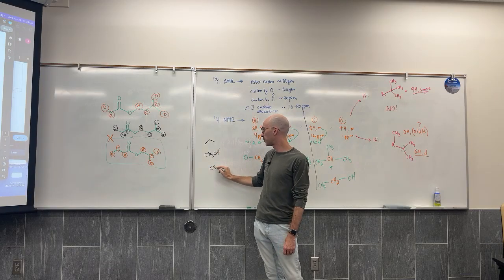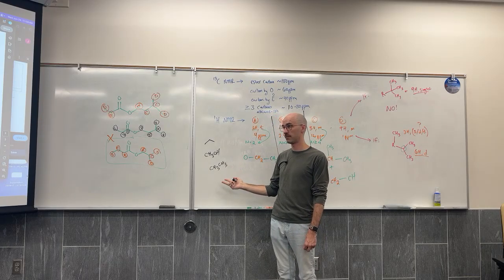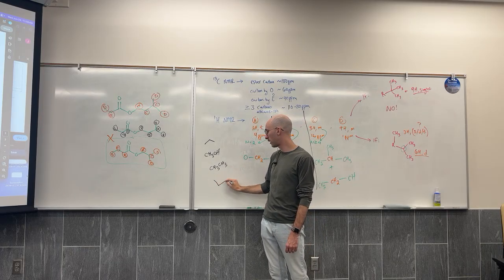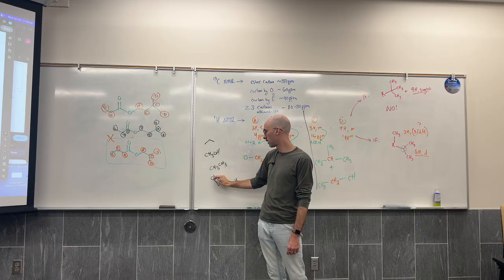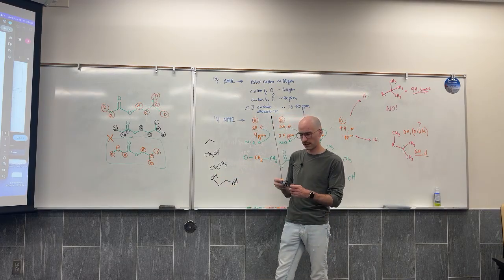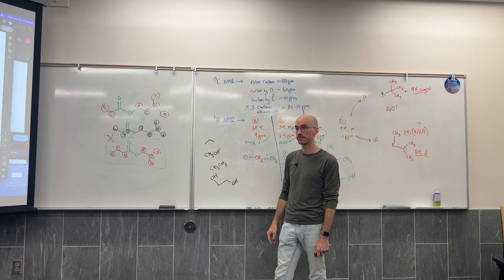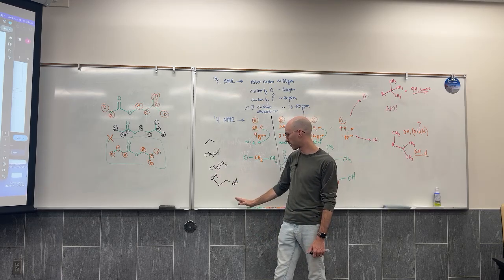If you analyzed ethane, they would give the same signal. Even if you analyzed glycol, 1,2-ethane diol, those are identical, because those are just the same CH2s. Yeah, they're symmetric to each other.